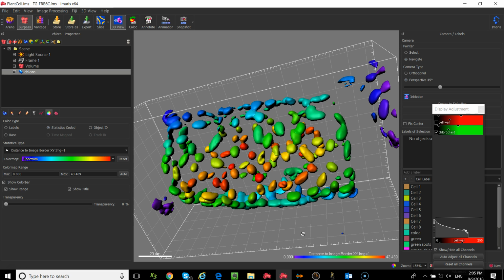Okay, how are we for time? We're not great. So we have about half an hour left. So I wanted to just get this concept over because we're now going to start doing some other things that are going to use Creation Wizard. So I'm hoping that this is making sense so far because I'm going to start speeding up to crush it all in right now.